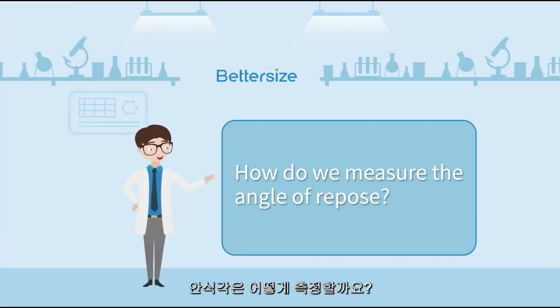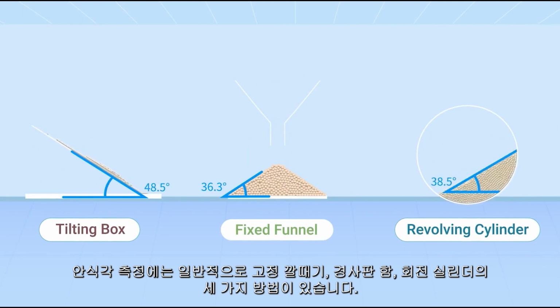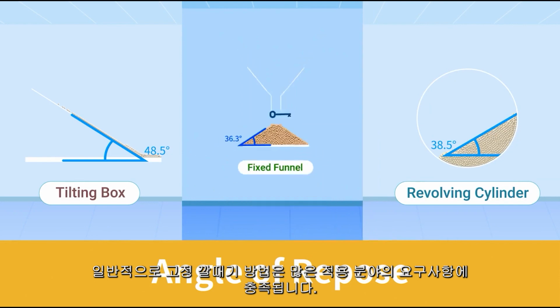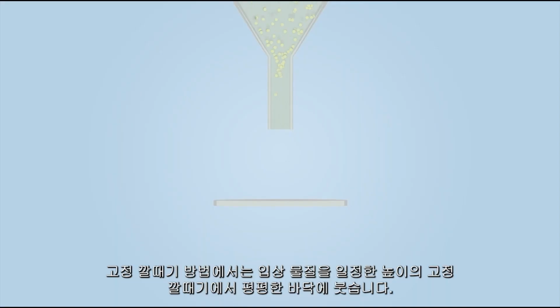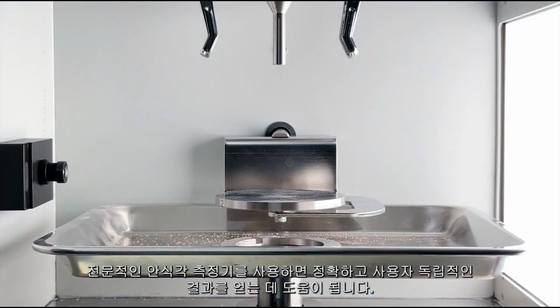How do we measure the angle of repose? There are three common methods to measure the angle of repose: fixed funnel, tilting box, and revolving cylinder. Similar to its definition, these methods need to be selected based on specific material and application. In general, the fixed funnel method could meet your major application needs. In the fixed funnel method, the granular material is poured from a fixed funnel at a certain height onto a flat base. Then stop pouring the material when the heap reaches a predetermined width. A professional angle of repose tester will help you obtain an accurate and operator-independent result.